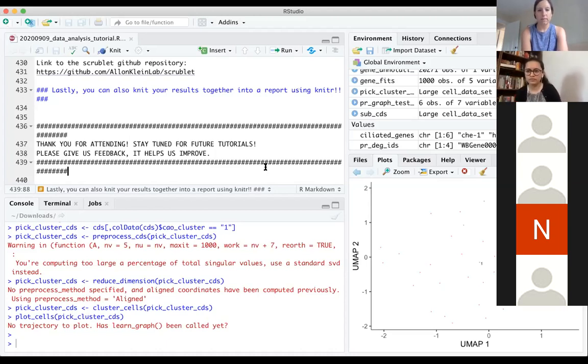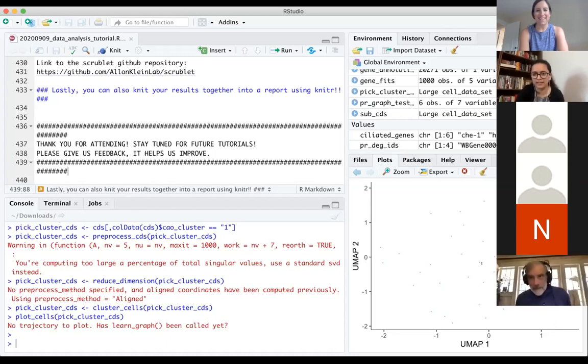Any other question? So we got another question about setting the seed, or just about how every time you run the trajectory analysis, it looks slightly different. So for example, when I ran it based off of your code, even though we were doing the exact same thing, it looked slightly different. So maybe can you talk a little bit more about why you see that slight variability? I'm going to punt this question to Brent, because he's had conversations with people that have had to do this. Brent, can you shed some light on setting the seed?